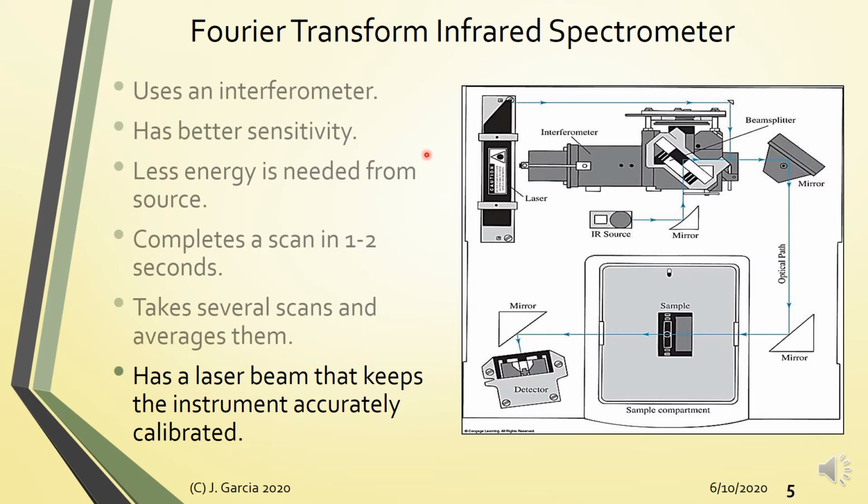And another reason why ayaw mo ng water is that, remember, the optical materials used for a given instrument should be, sabi nga natin, invisible towards the EMR region that you are using. And since infrared ito, alright, you cannot use here glass or quartz, because glass, quartz, or even plastic, of course, can absorb infrared radiation.